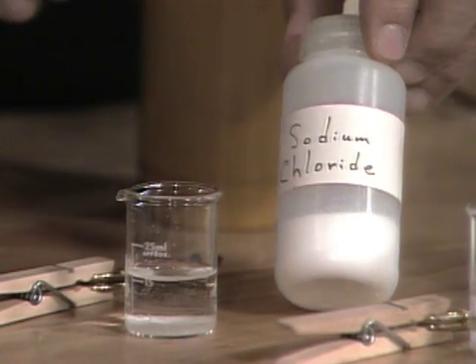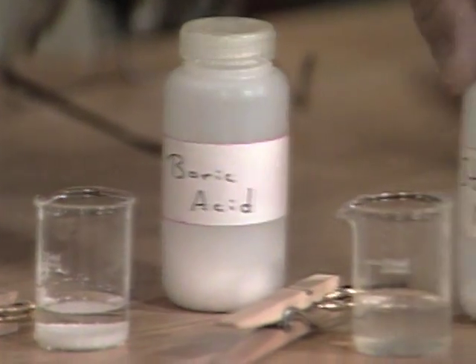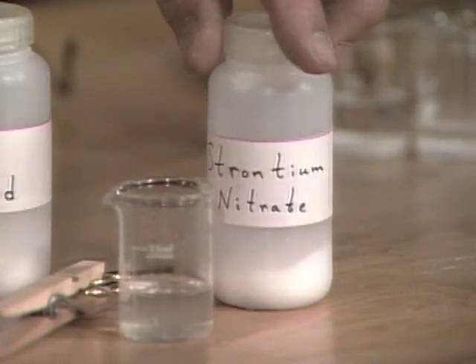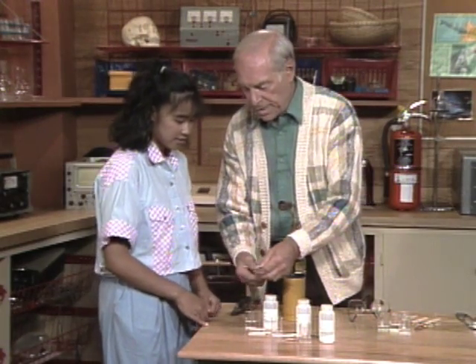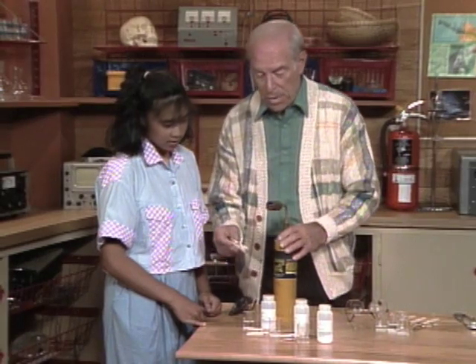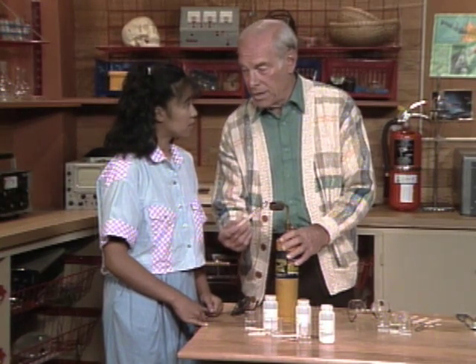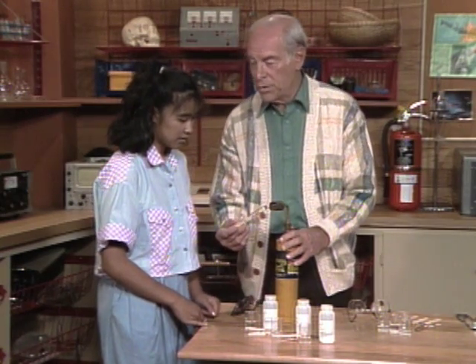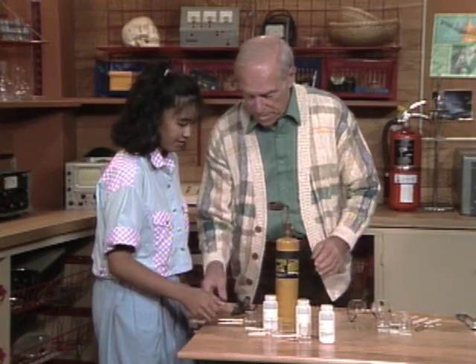So here are three chemicals: sodium chloride, boric acid, and strontium nitrate. What I'd like you to do is take one of these clothespins that has a safety pin stuck in the end, dip it into the solution, bring it up here, and hold it in the flame of the blowtorch and notice the color of the flame. That's what's going to help identify some unknowns later.